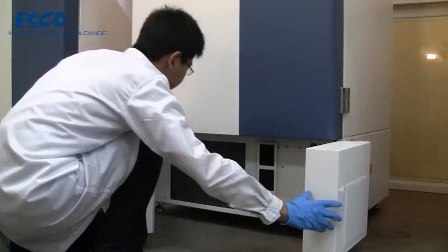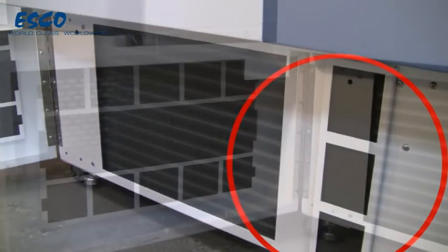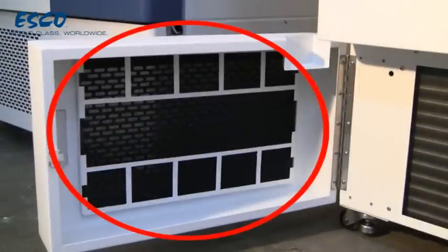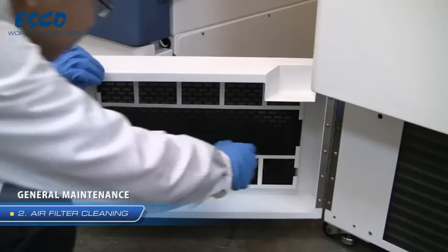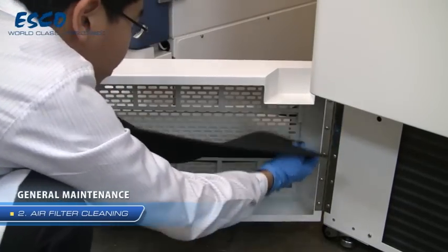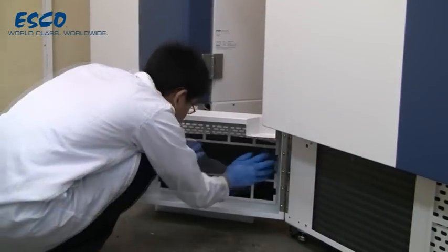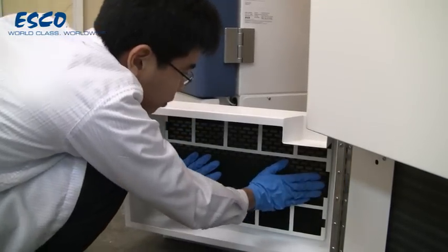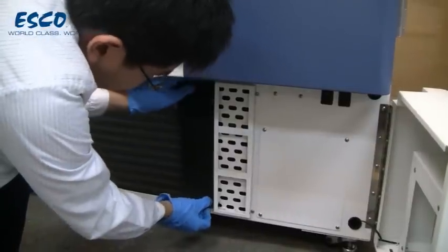To clean the air filter, open both the left and right bottom doors. There are two air filters installed. Remove the condenser air filter and wash it in water. Dry it out and place it back in the air filter holders. The air filter condition should be inspected and washed once every three months.